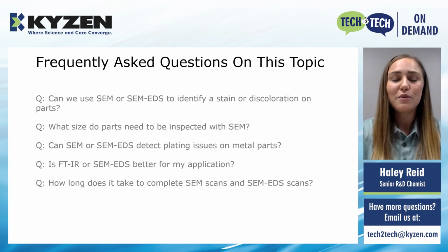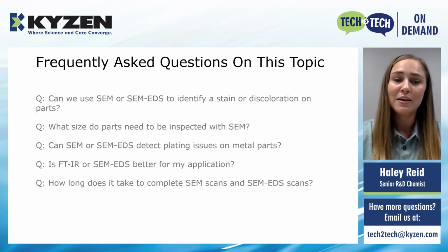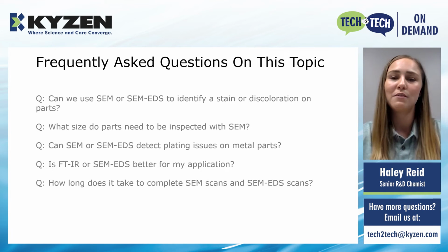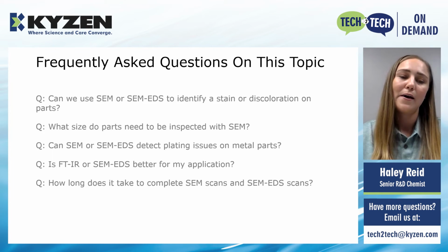Okay. So, frequently asked questions about SEM and EDS. Number one, can we use SEM or SEM EDS to identify a stain or discoloration? This often comes up with metal parts. Hey, my part is too dark. There's a blue hue, there's a yellow hue, any of that.